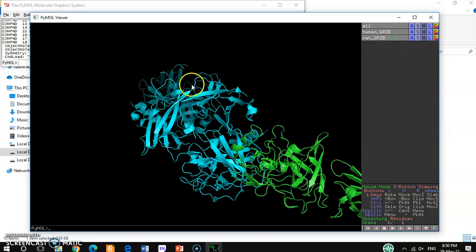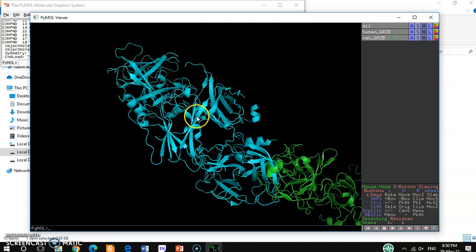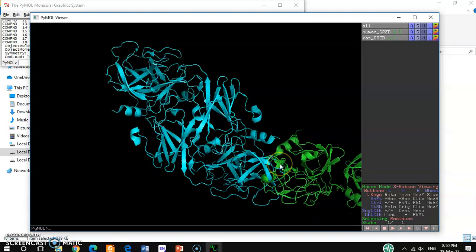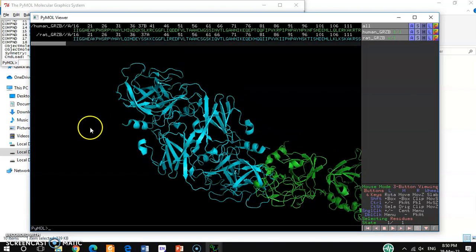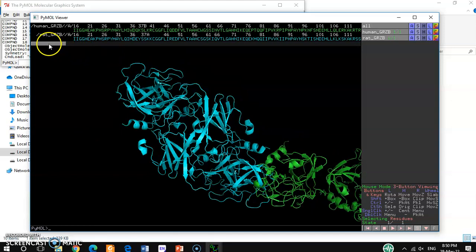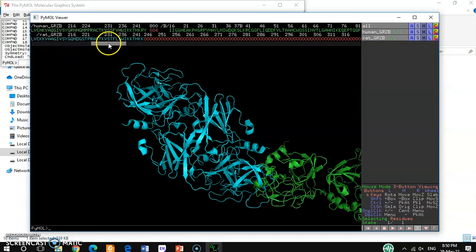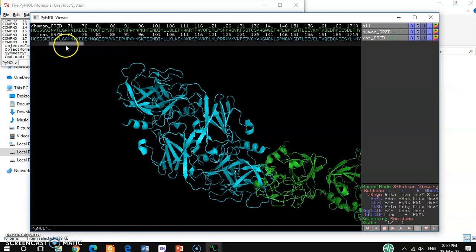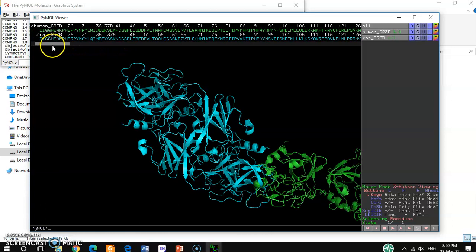Then you have to hit this button to show the linear structure of this protein. This is the linear sequence of this protein. If you want to select any specific part to align, you have to select it first.